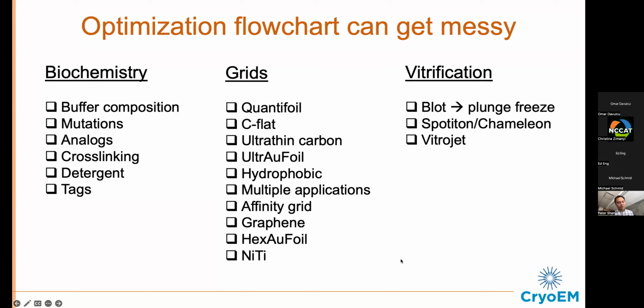One of the motivations for me and Janet Iwasa to develop cryo-EM 101 is recognizing that it's still the wild, wild west when it comes to people coming up with their own tricks and solutions to making the perfect cryo-EM sample. And so we teamed up to develop this website, and I won't talk about it extensively because all of you can just log on to it and see for yourself.